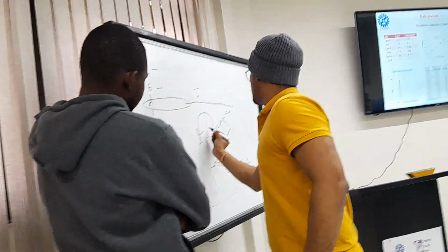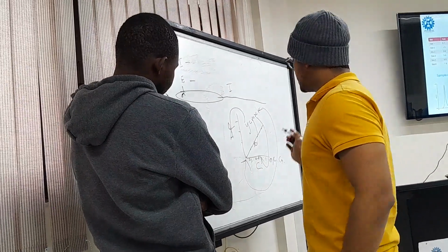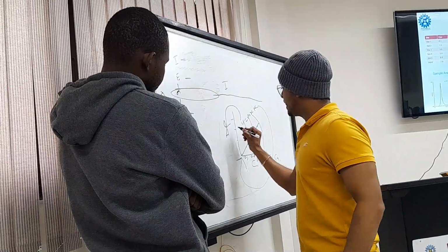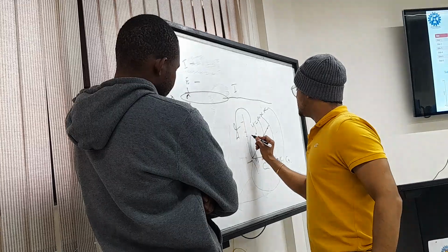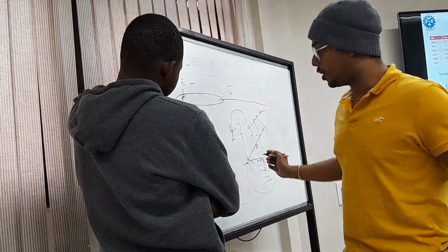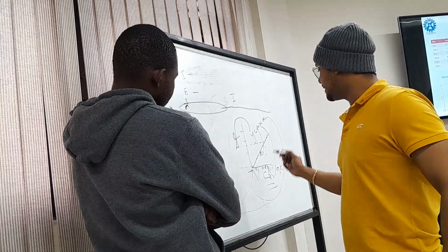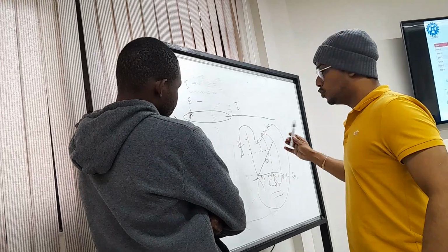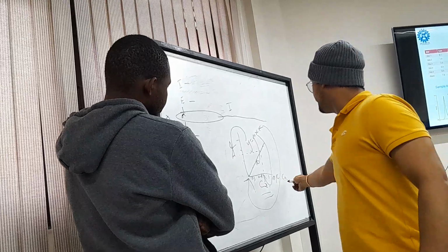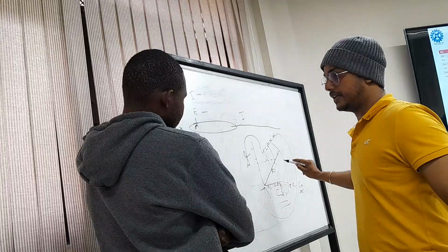It depends on the absorbance value, and that's how you get this straight line here. Now, when you aspirate your unknown sample, you get an absorbance value, and that is extrapolated to concentration. That's how you determine the concentration of your unknown. It's important that you dilute your sample so that whatever metal you're looking at falls within the linear range of the instrument.